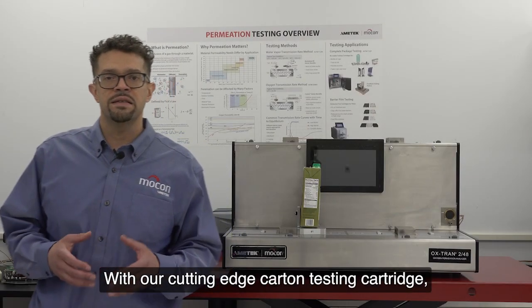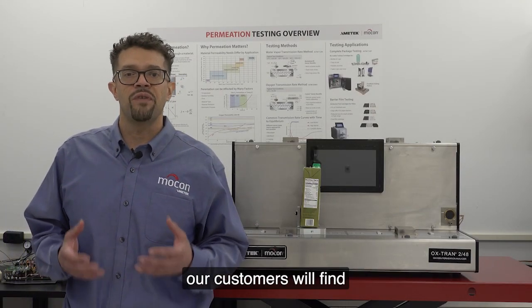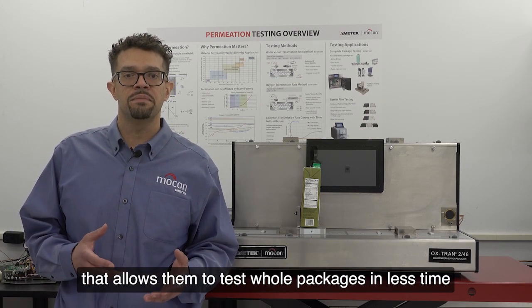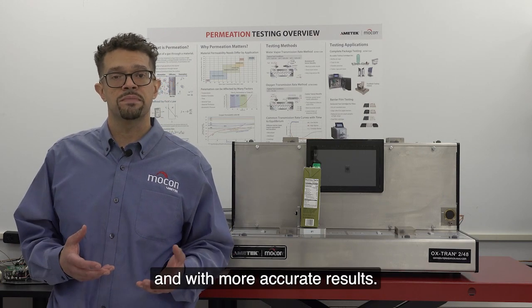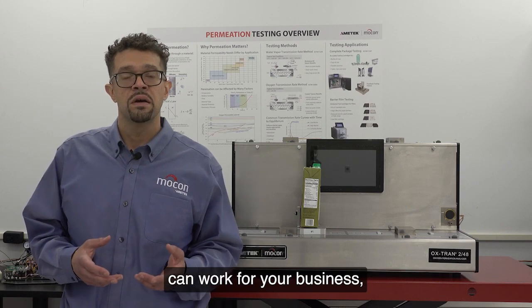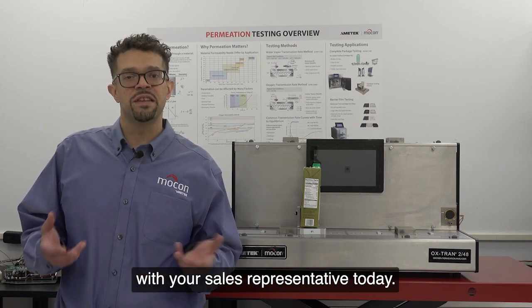With our cutting-edge carton testing cartridge, our customers will find a one-of-a-kind product that allows them to test whole packages in less time and with more accurate results. To learn more about how this cartridge can work for your business, please get in touch with your sales representative today.